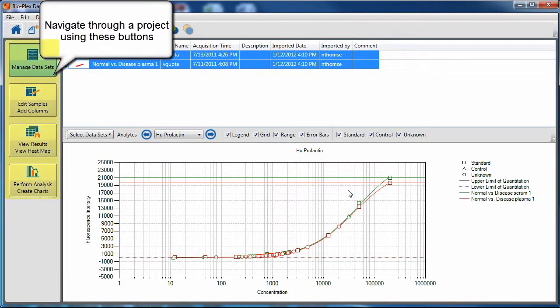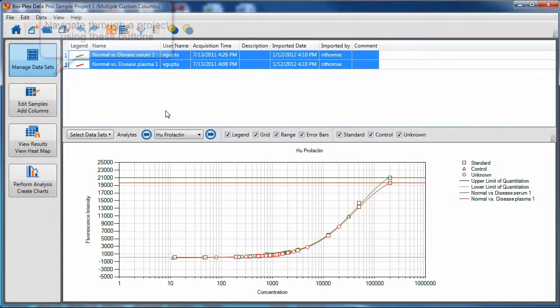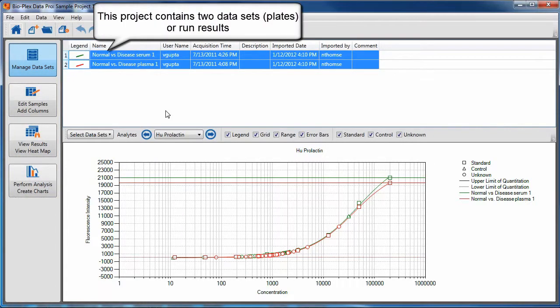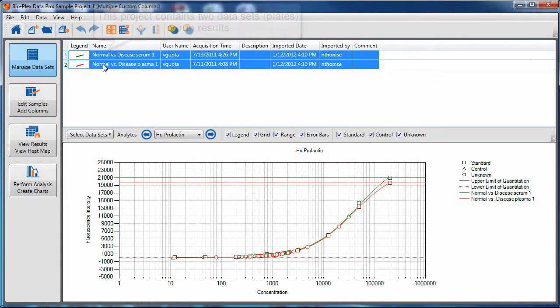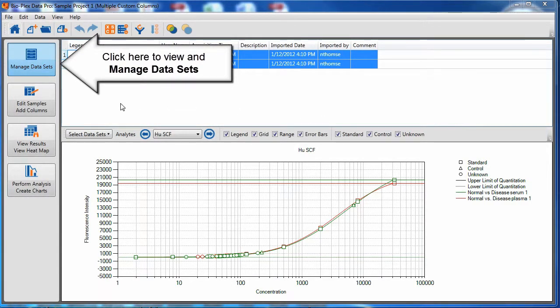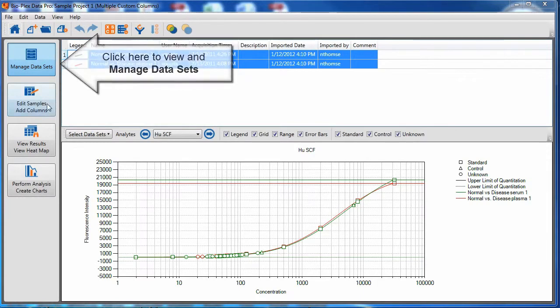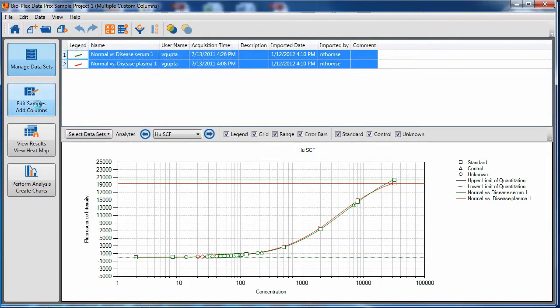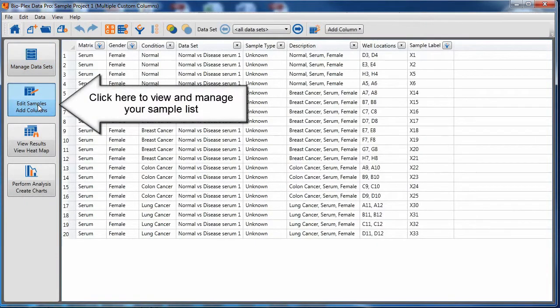Navigate through a project using the buttons on the left. This project contains two data sets or plates or run results. Click here to view and manage your data sets. Click on the second button to view and manage your sample list.